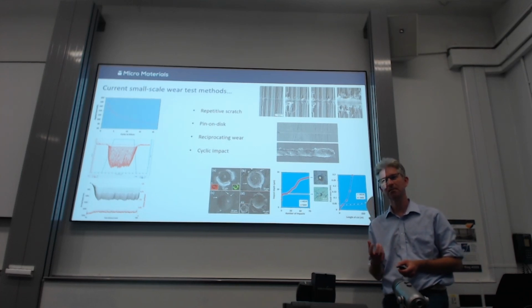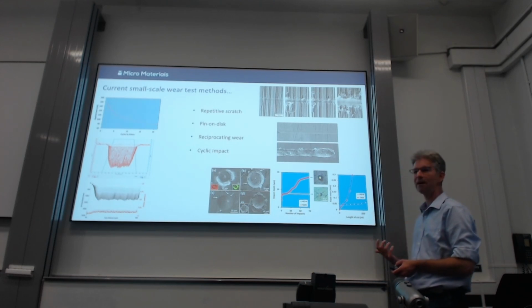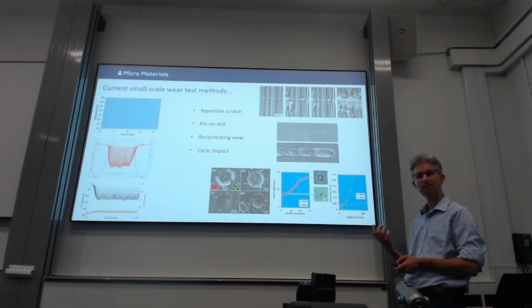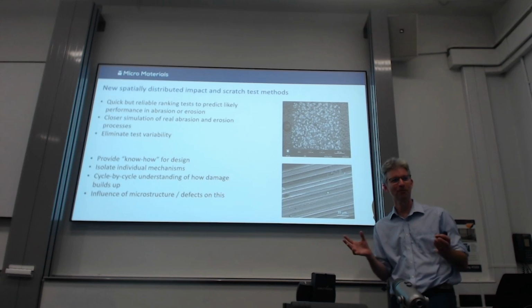The thing we're trying to simulate, it may correlate quite nicely because we're catching enough of the contact. In the impact, for example, we're catching the high strain rate and we're catching the severity of the contact and things like that. But it gives us an option at least to design more closely simulating tests. More complicated, sadly. You don't get one thing for nothing.